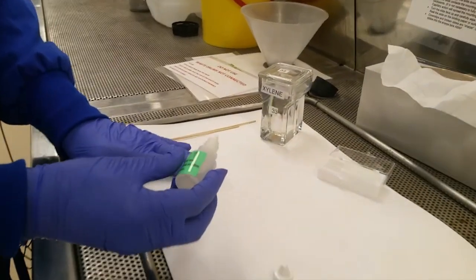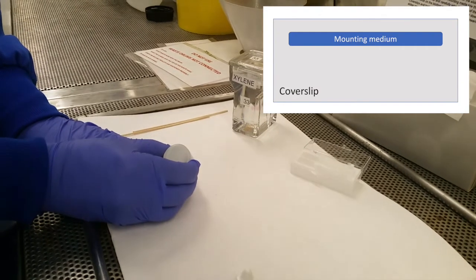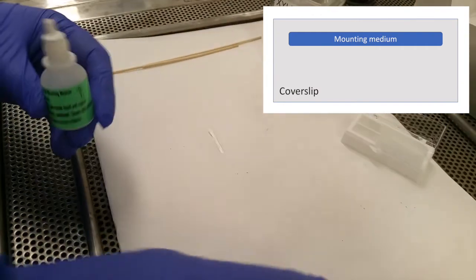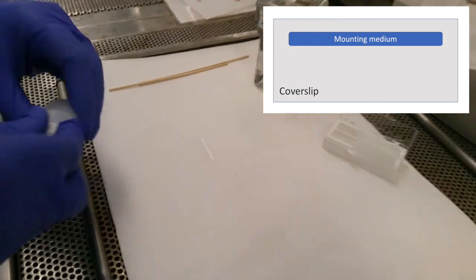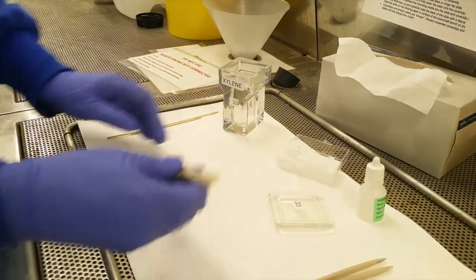So this is where I just apply a very thin line of mounting media, and you can see there in the diagram what I'm aiming for there in the blue is the approximate width and length of the amount that I'm dispensing just inside the edge of the slide.